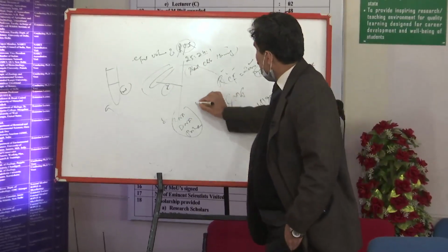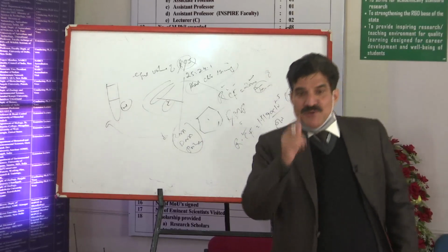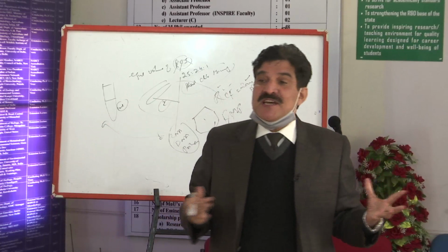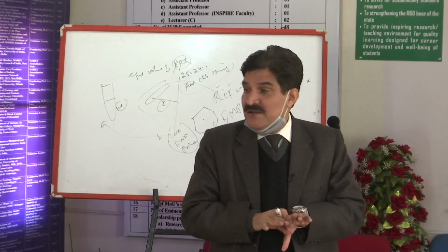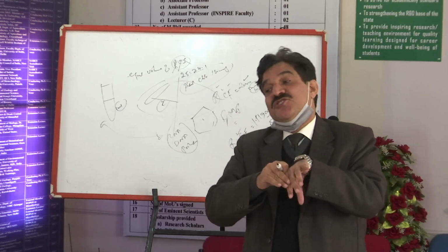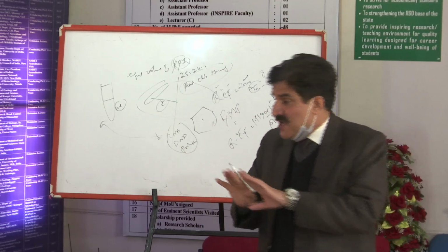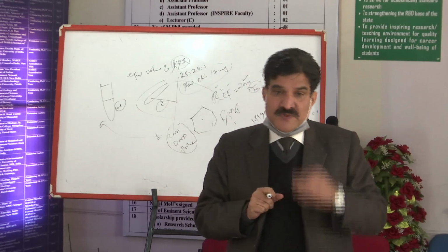This phenol has a hydrophobic ring system and precipitates proteins, because proteins contain phenylalanine, tyrosine, tryptophan, the aromatic amino acids. Because of their presence, hydrophobic interactions take place and proteins are precipitated in the phenol phase.